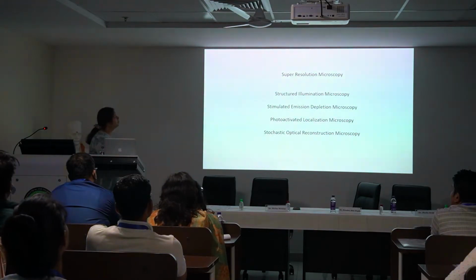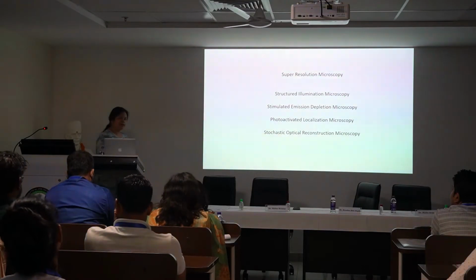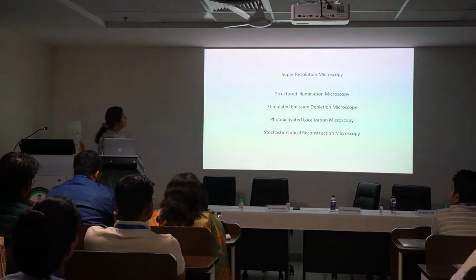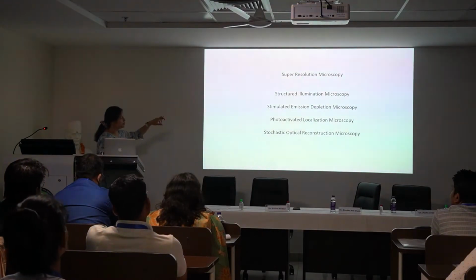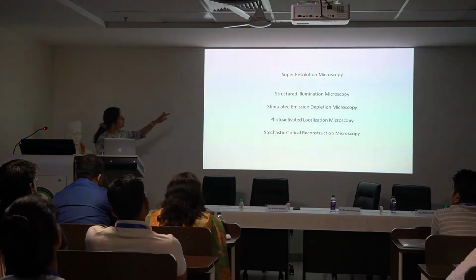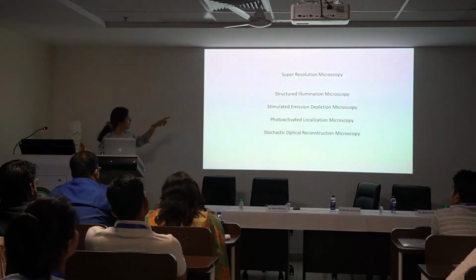Now, there are a few methods which have gained popularity in the last two decades. Of them, I will very briefly introduce structured illumination microscopy and go a little more into detail with an example of our own experience with STED.